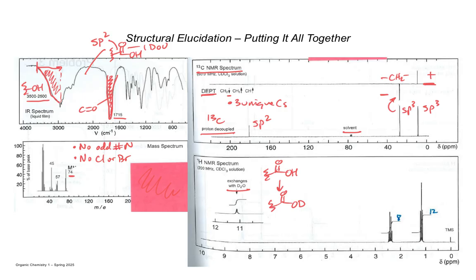Other than that, how many sets of hydrogens do you see in the proton NMR? We see 2 unique sets. Then I have these numbers written in blue that say 8 and 12. If you notice this curve here, back in the day in earlier NMR experiments, that was called an integration curve.